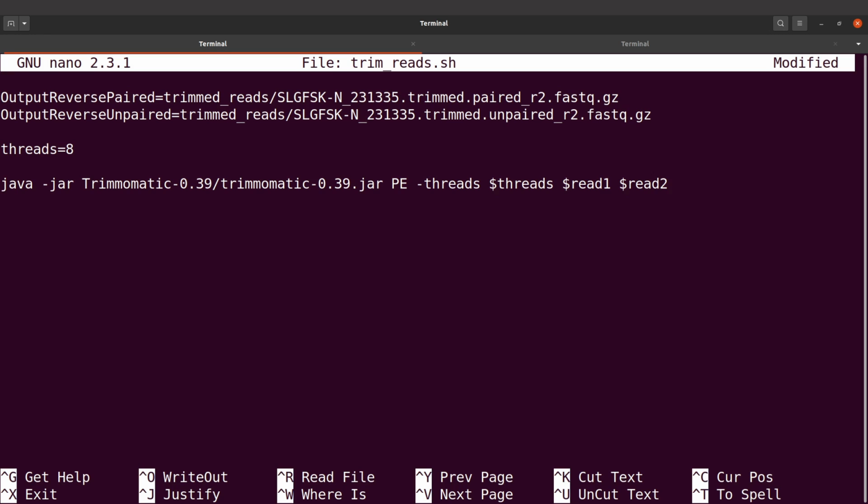Now we need to also indicate the output files. So how do we do that? Let's look at it. Because if you try to supply too much information, it may be a bit complicated, or you have lots of information on one line. We will split them into separate lines. So here I'll bring a space and I'll say backslash like this. So the backslash here means that the continuation of this line is in the next line. That's what it basically means. So it's just a way to make things convenient for us.